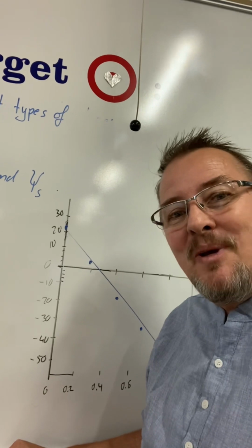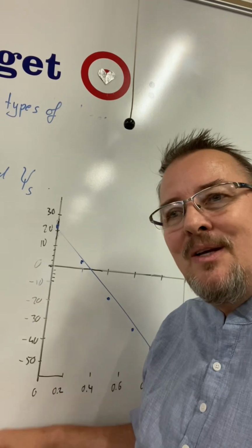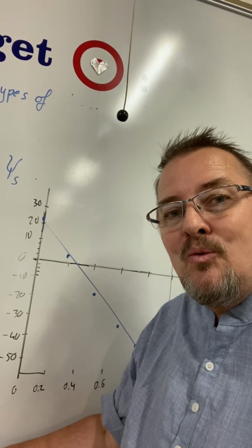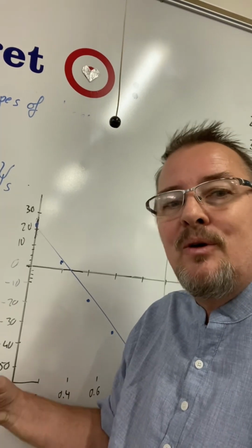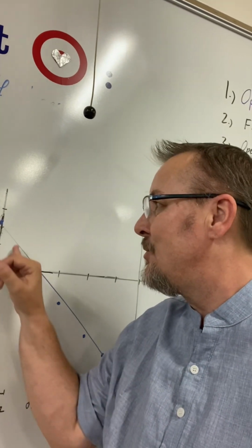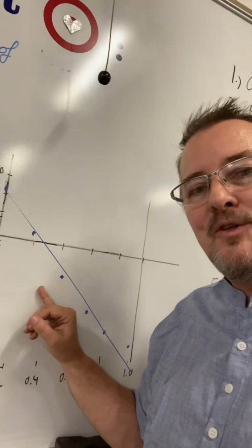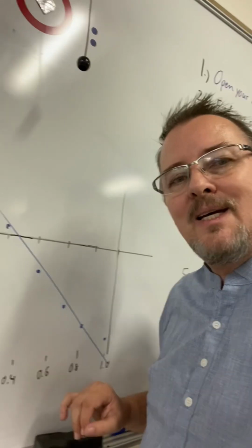Okay, you have your line of best fit. Now let's talk about what's happening here. You know osmosis was happening with the potato core. When the potato core was in distilled water or 0.2 molarity, you saw that it gained mass. That means water went into the potato core and we had a positive % change. These are those 2 data dots here. And then after a while, when we used a higher concentration, we had a negative change in the mass and therefore a negative % change. And the dots are below the x-axis.